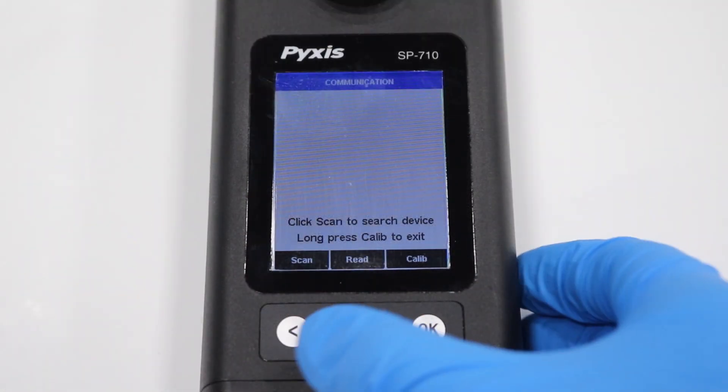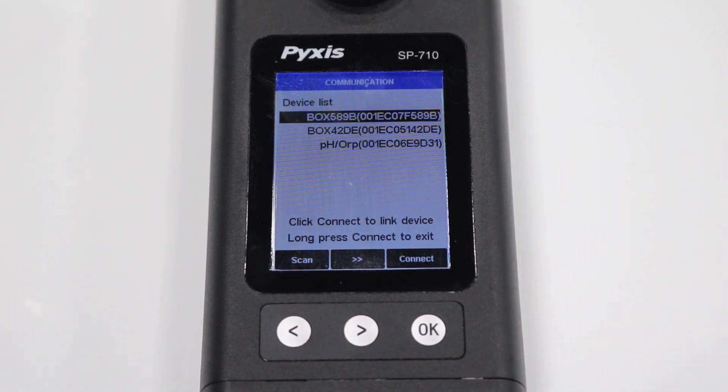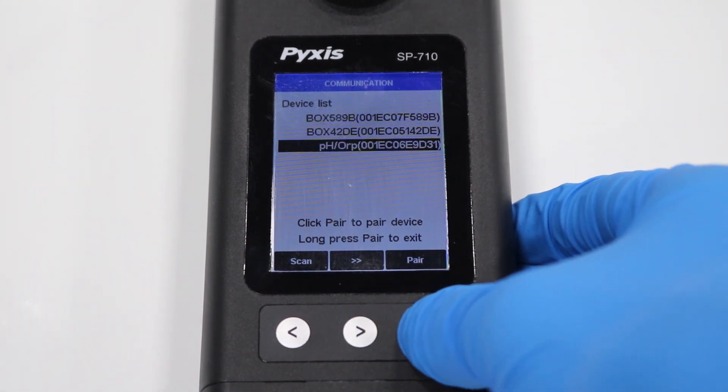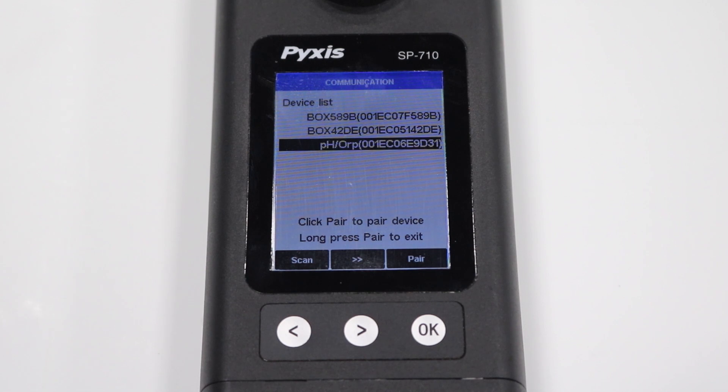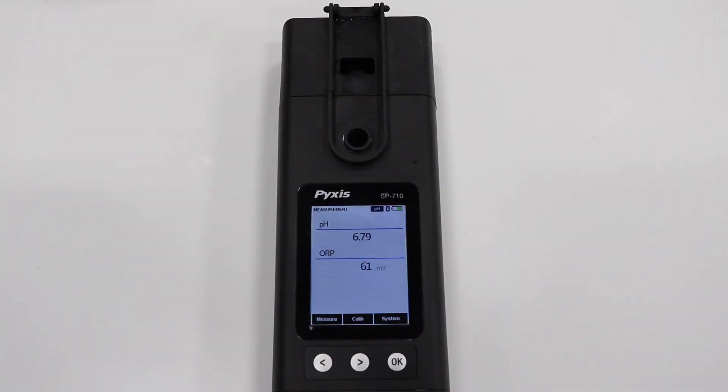Then press the left arrow button to scan for the new module. Use the right arrow button to navigate to the new PHORP module and press OK to pair. A pair success message will appear and you are now able to measure with the new module. Thank you.